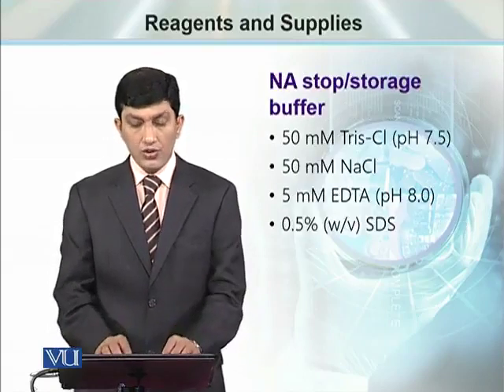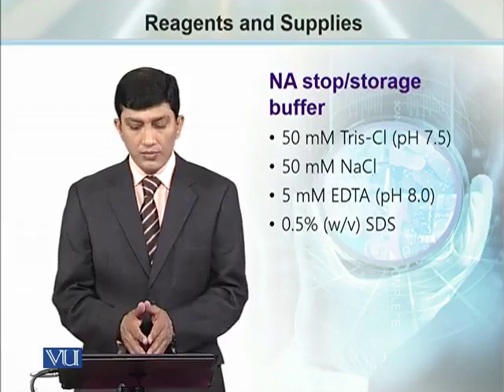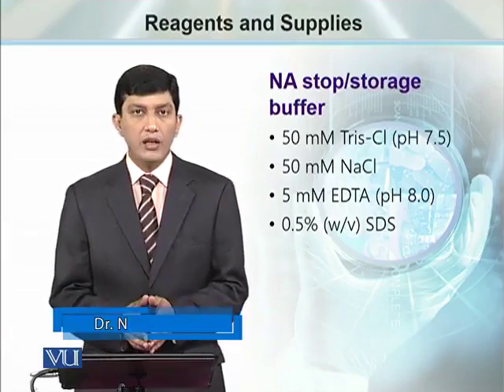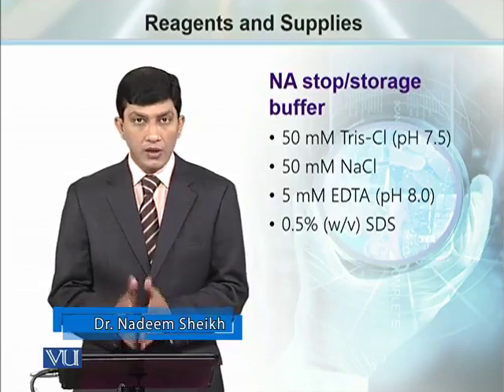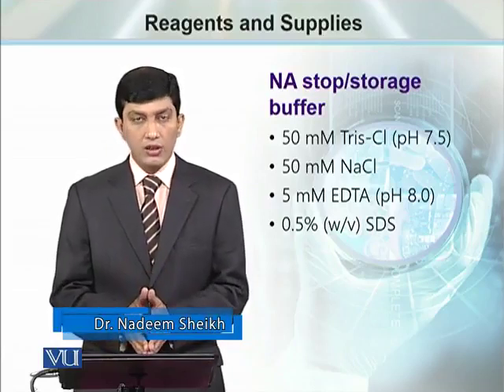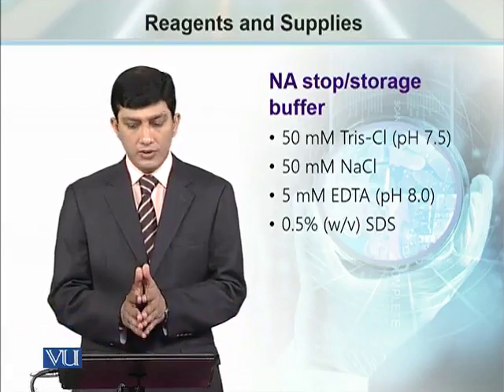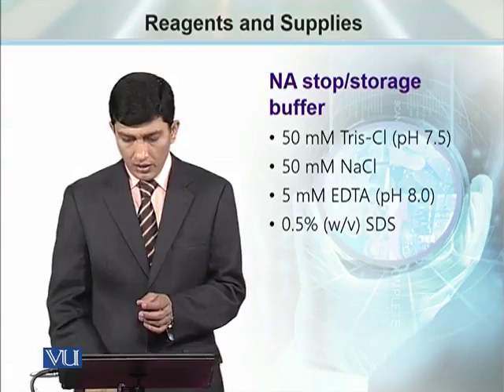Then we need the stop or storage buffer that has a composition of tris HCl, sodium chloride, EDTA and SDS. This slide shows you the composition, that what should be the molarity or the concentration or the percentage of different components as well as their pH.